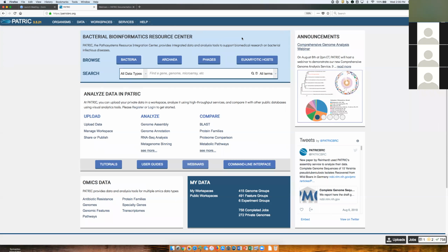Thank you for joining the PATRIC webinar on our new service, the Comprehensive Genome Analysis. This is a new thing we've launched that I'll go through. I'll give you some discussion of why we're doing it, but I also want to encourage you all. We'll go through the webinar.